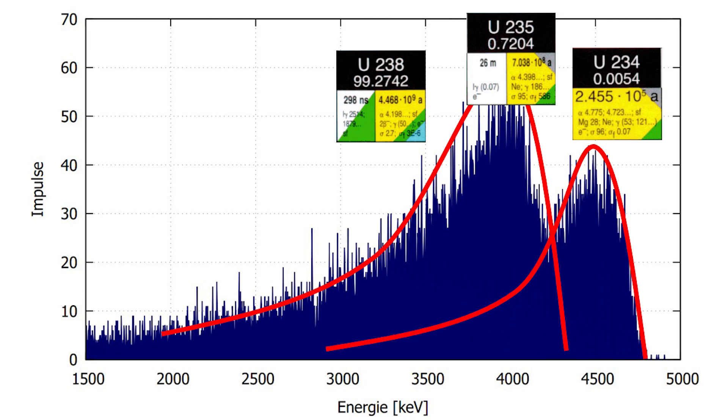Well, uranium-235 has an alpha energy of 4.4 mega electron volts, which is easily missed. But if you look closely and want to see it, you can vaguely discern the right turning point there.